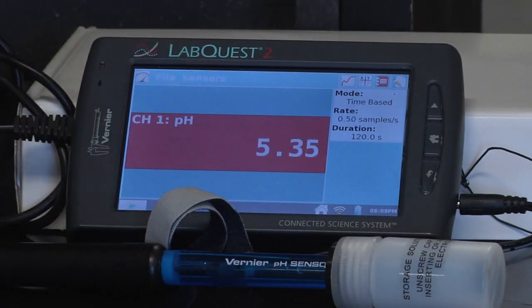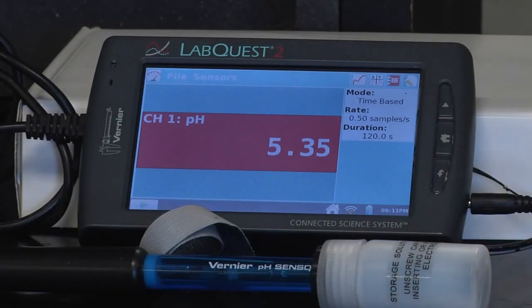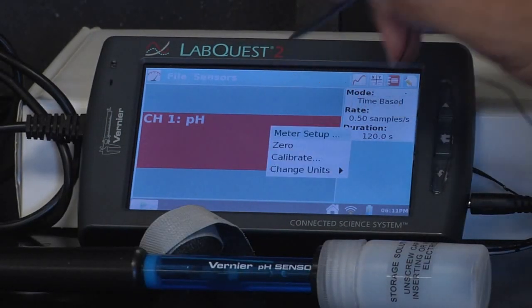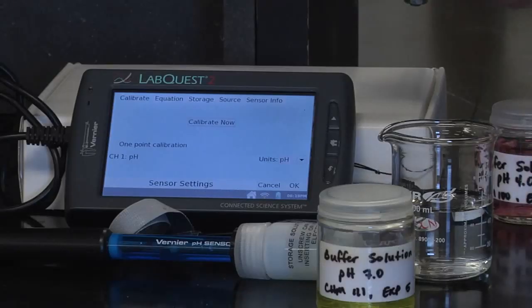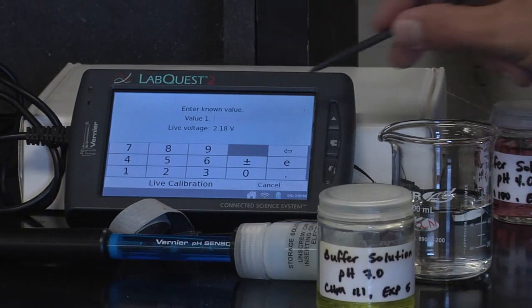Once you plug it in, it will begin reading pH. In order to calibrate our sensor, we're going to have to touch the screen and then select calibrate. Calibrate now button, which will take us to this screen.